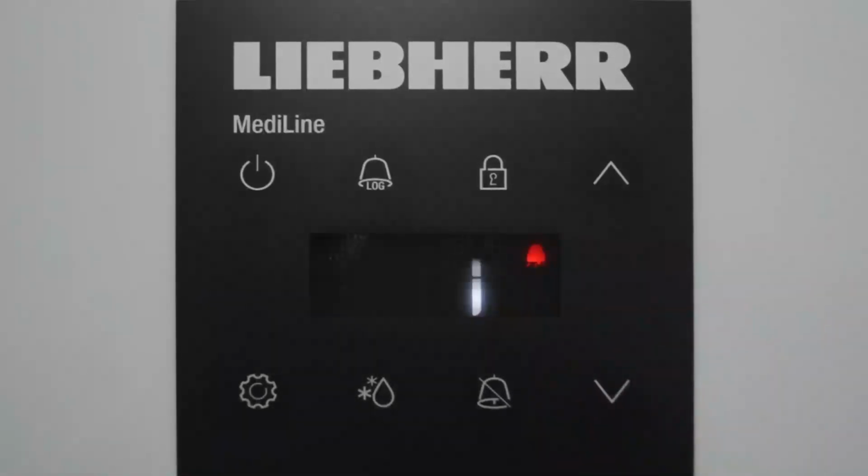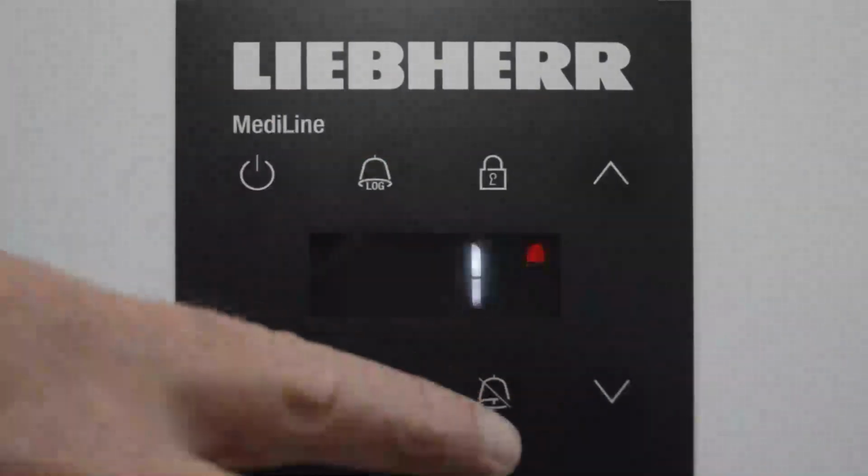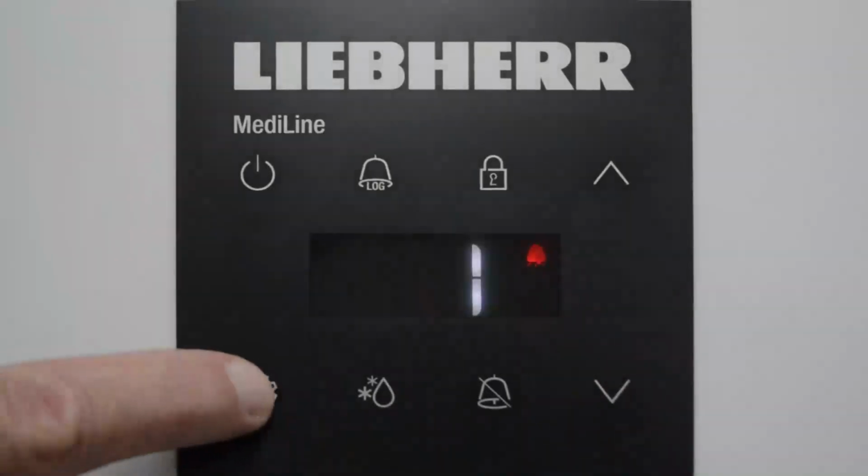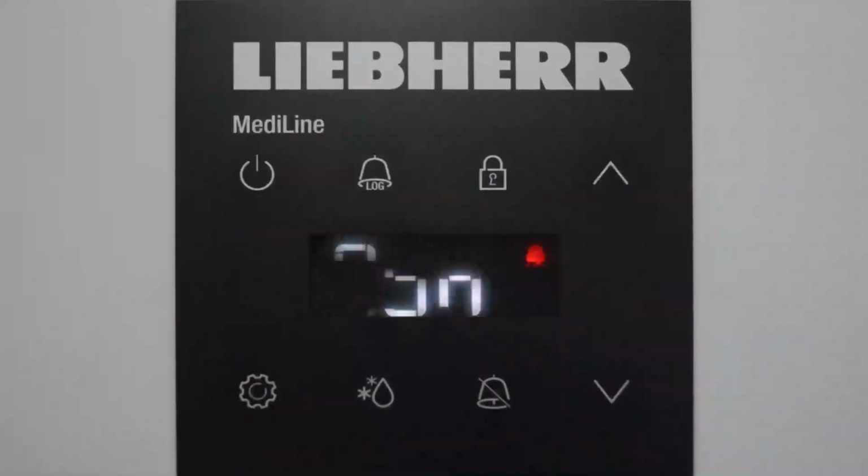reactivated the audible alarm. So what will happen if someone deactivates the audible alarm when it's beeping and turns it off? It will then reactivate at the preset time that we set in the delay previously. Press enter to select that.